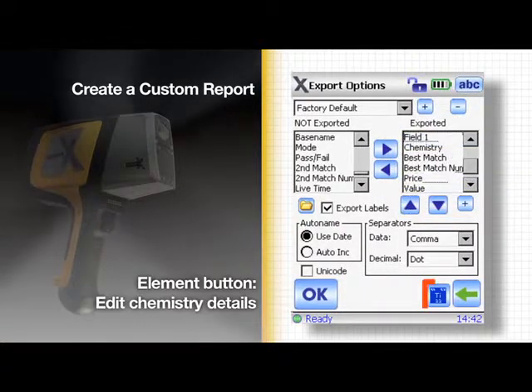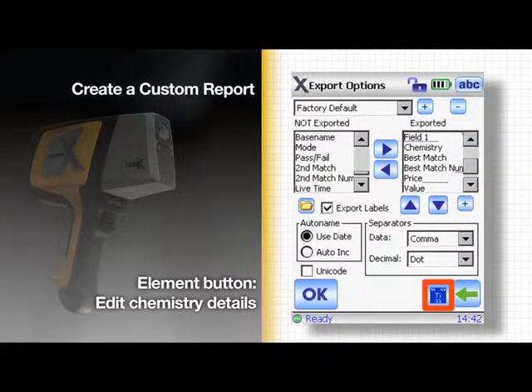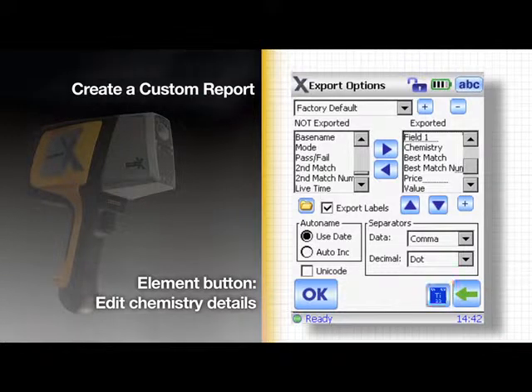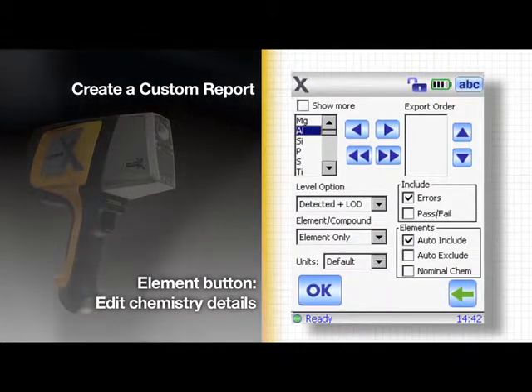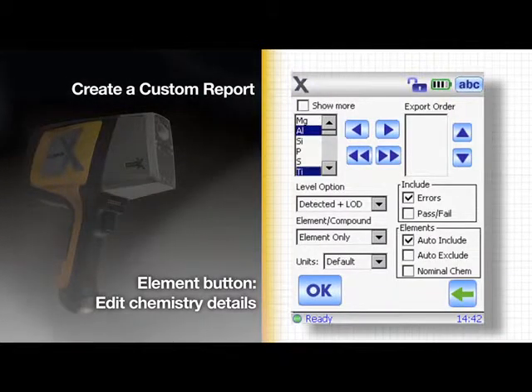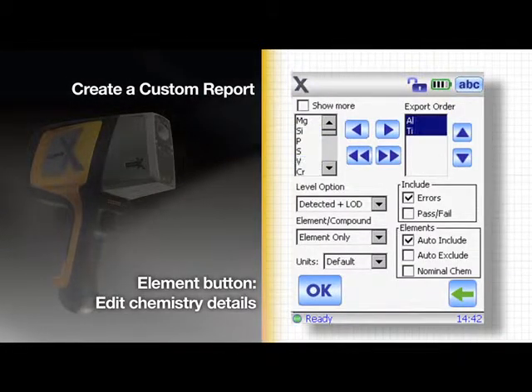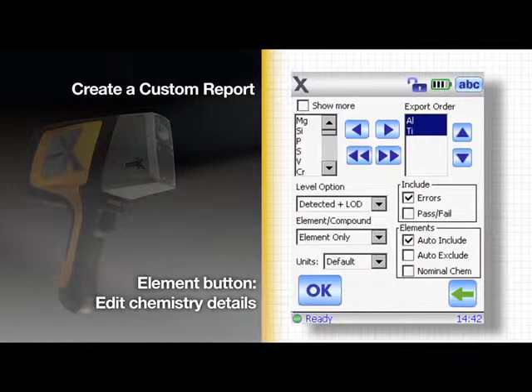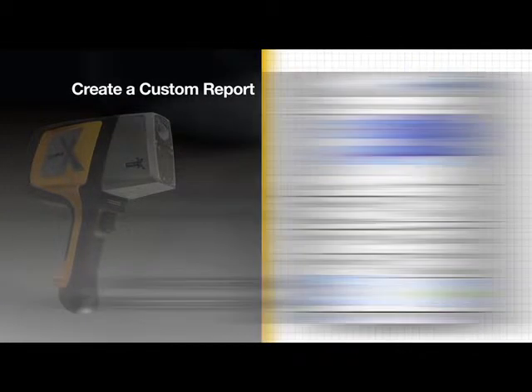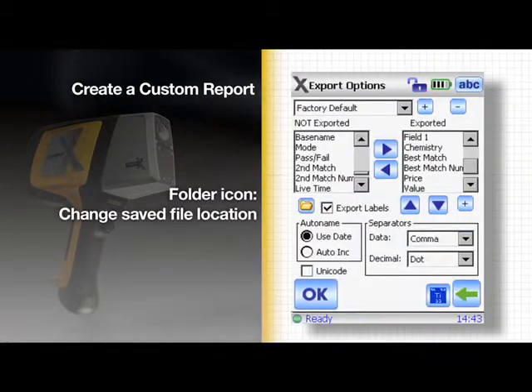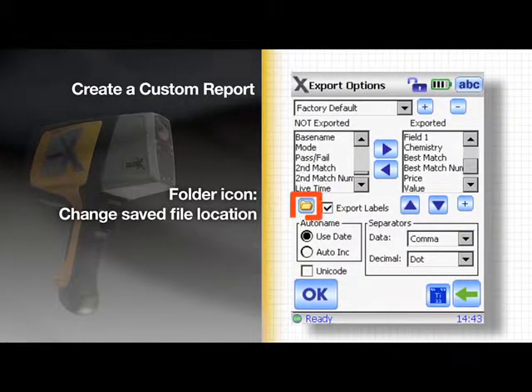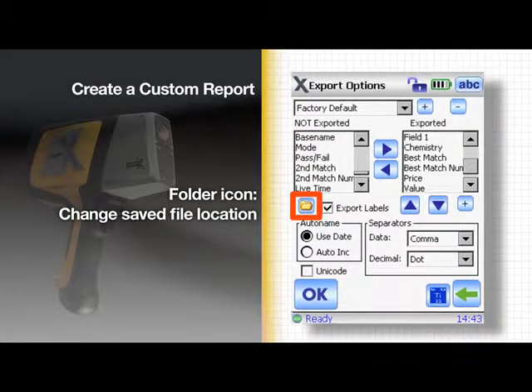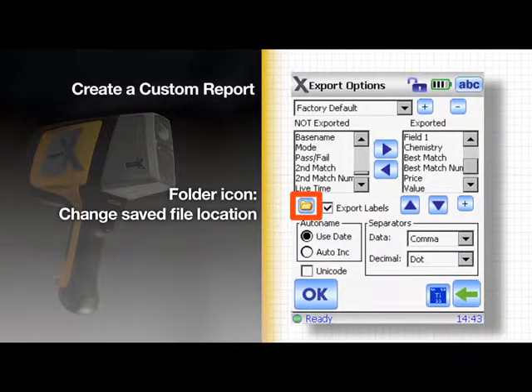Press the element button to edit the details of the chemistry section. Elements can be added or removed from the report just like other columns. To change the location of the saved file, select the export destination by tapping the folder icon.